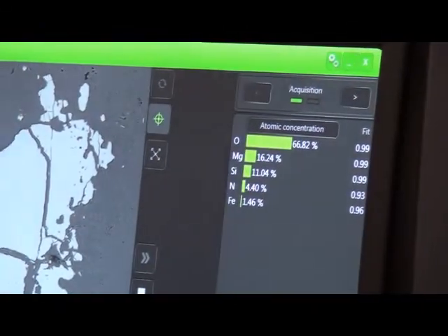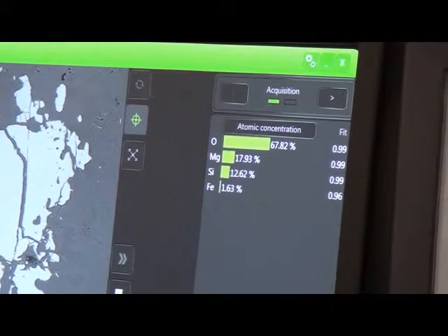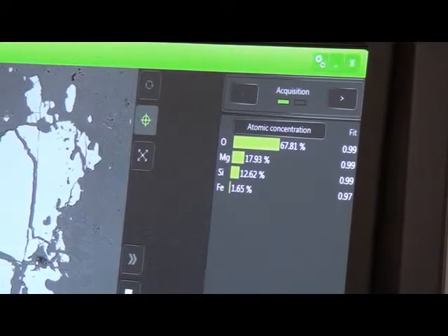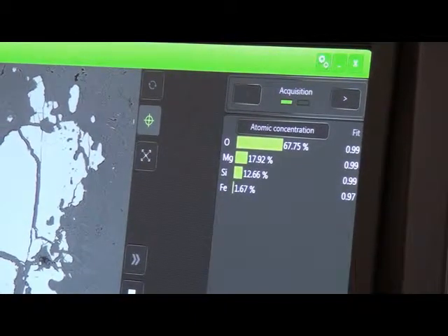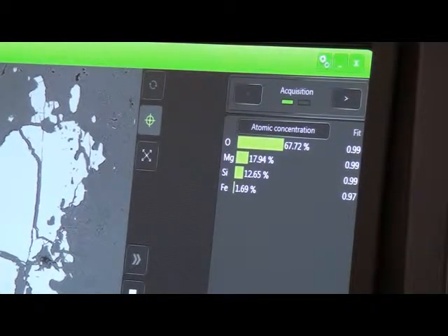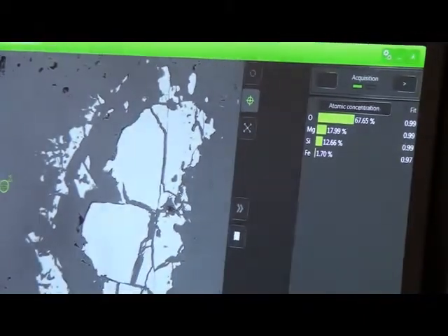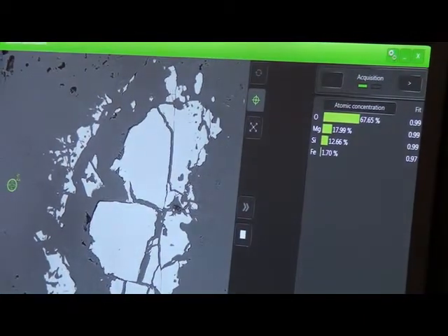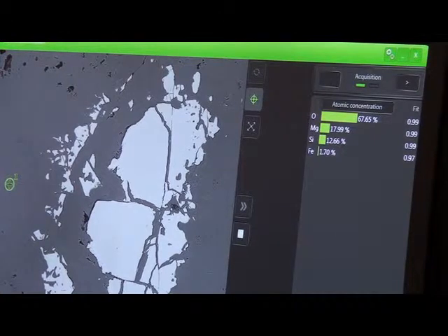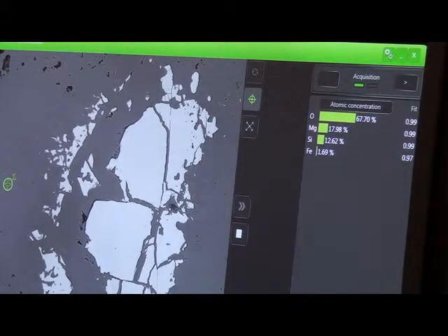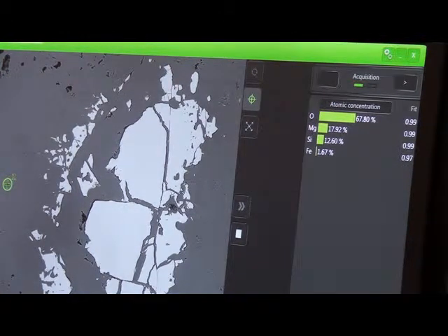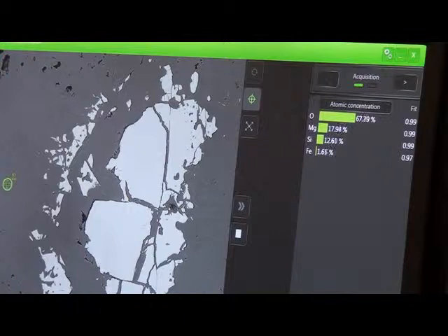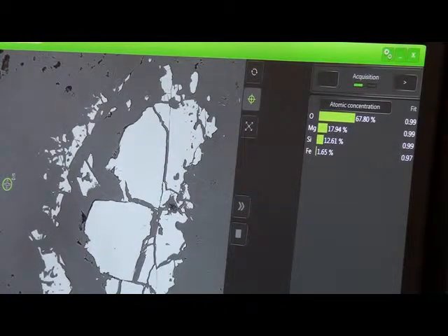So we're going to look at the dark one and look what it's largely consisting of. You can see the computer giving you its estimate of what elements may be present. Lots of oxygen. The Earth's crust is more than half oxygen so that's entirely probable. You've got a good amount of magnesium, a fair amount of silicon, and a tiny amount of iron.